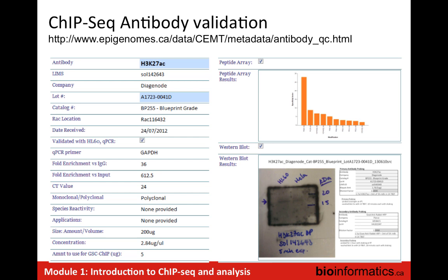There are monoclonal antibodies that are becoming available. So CST has a monoclonal now for H3K4 trimethylation. That, I think, is very good quality and has been around for many years. But most of the K27 acetylation antibodies, for example, are still polyclonal, although there are some monoclonals starting to emerge. If you can get a monoclonal, obviously that's the way to go, because then you have a secure source for replacement. But in some cases, monoclonals just don't behave in ChIP-seq experiments.